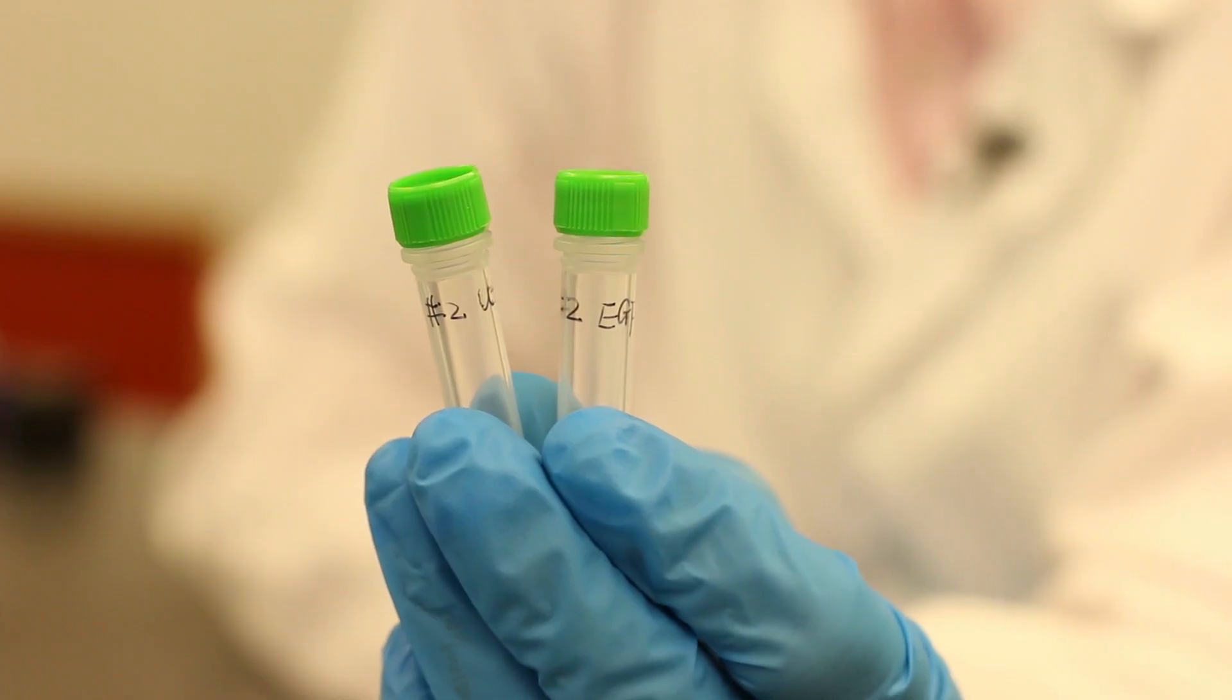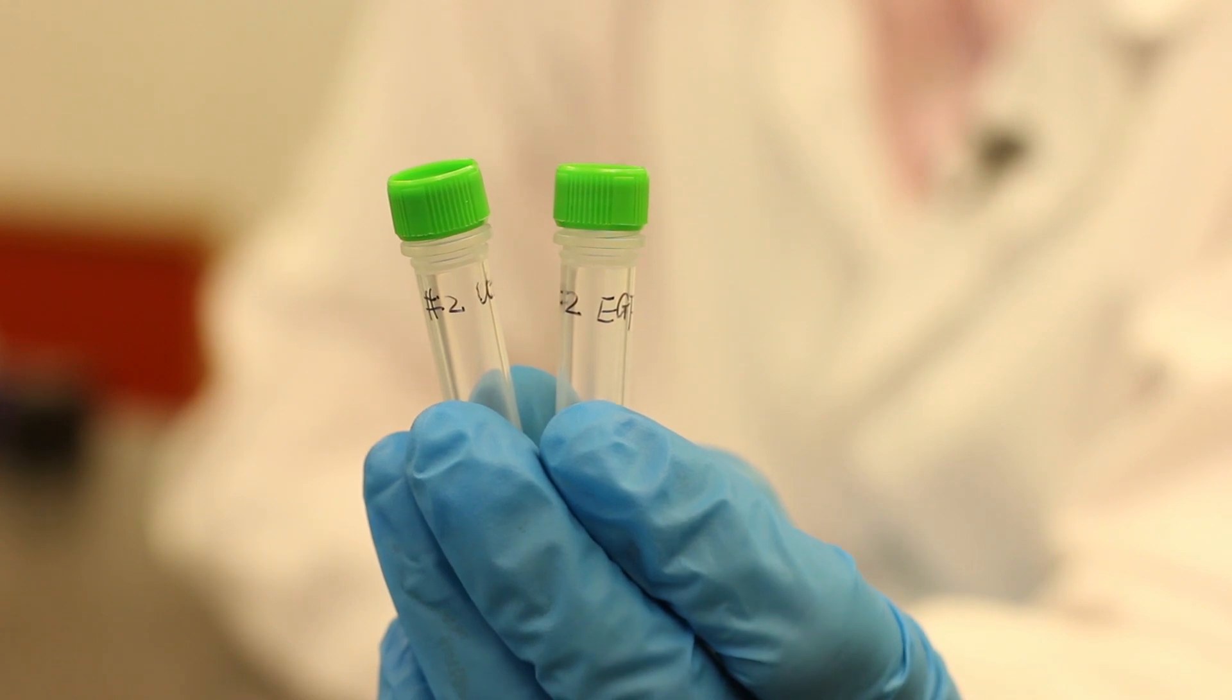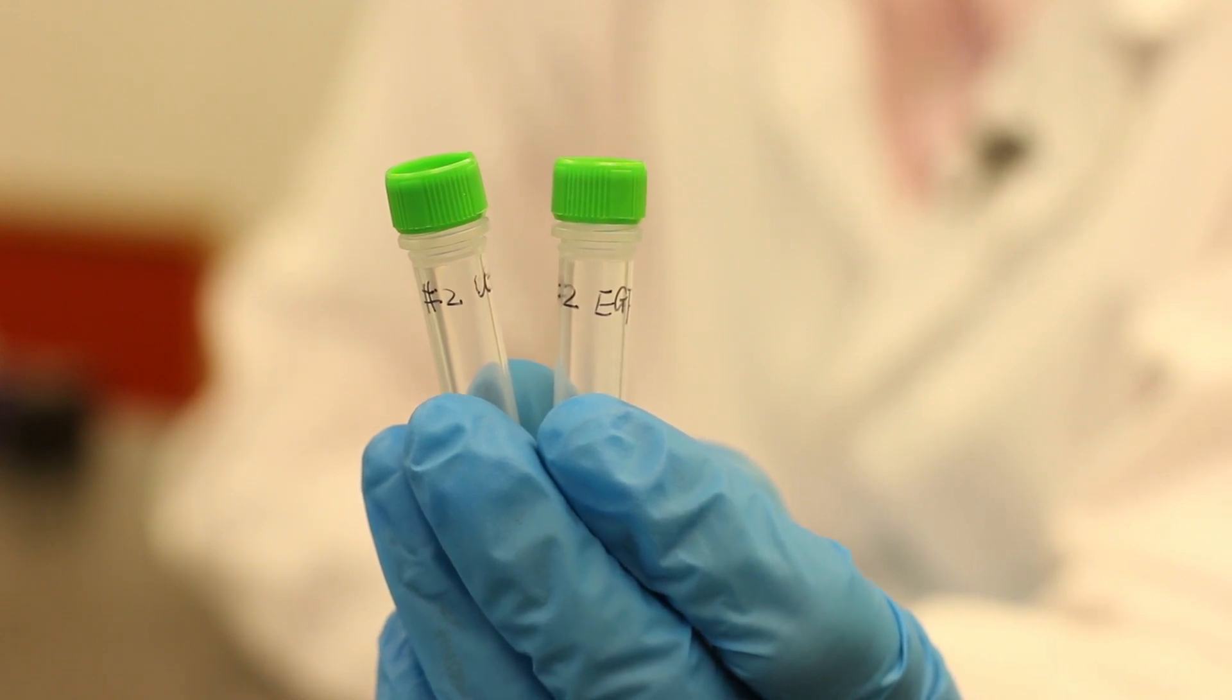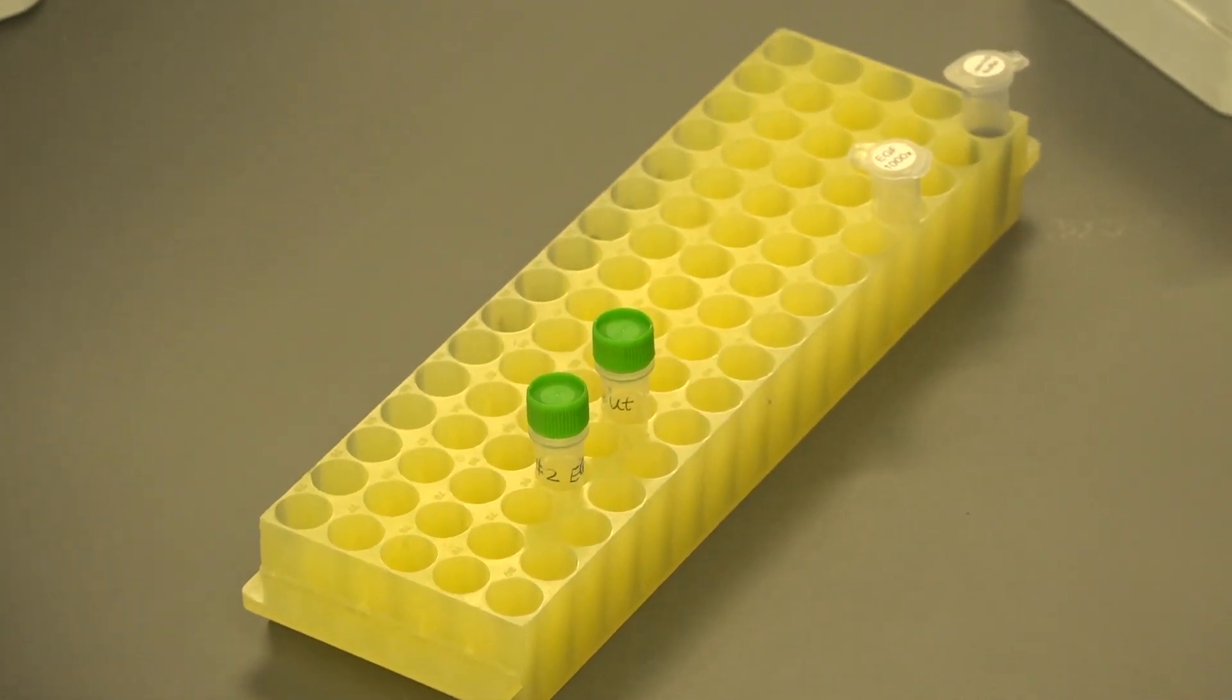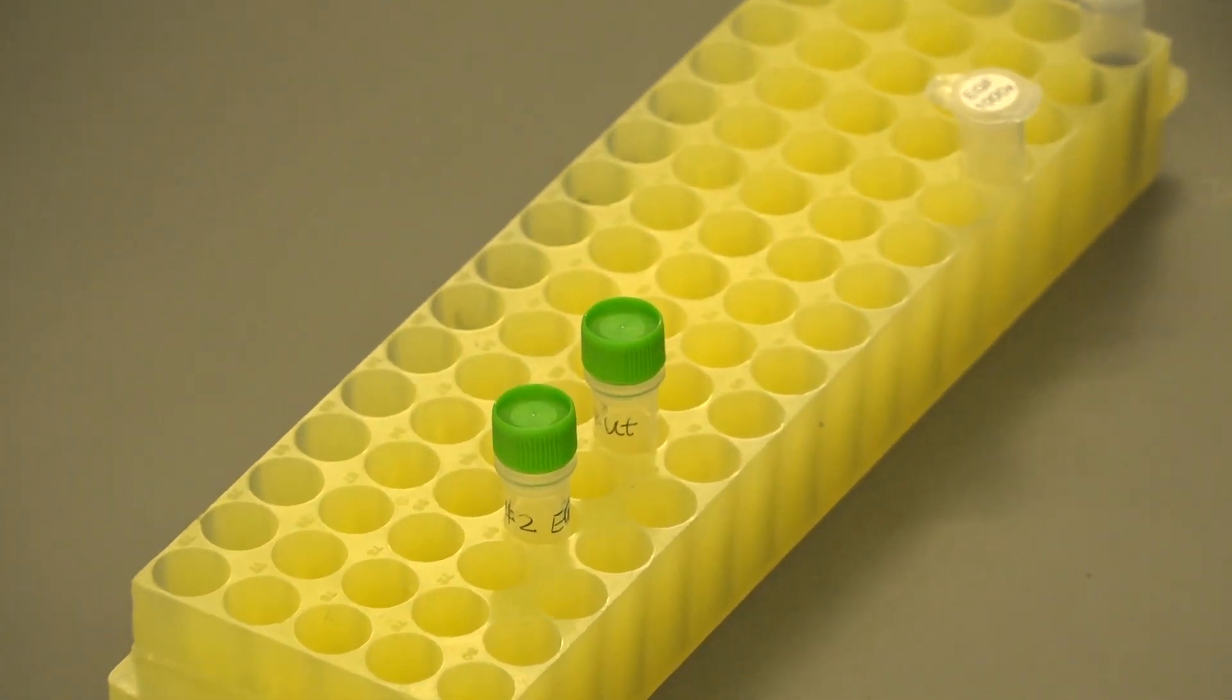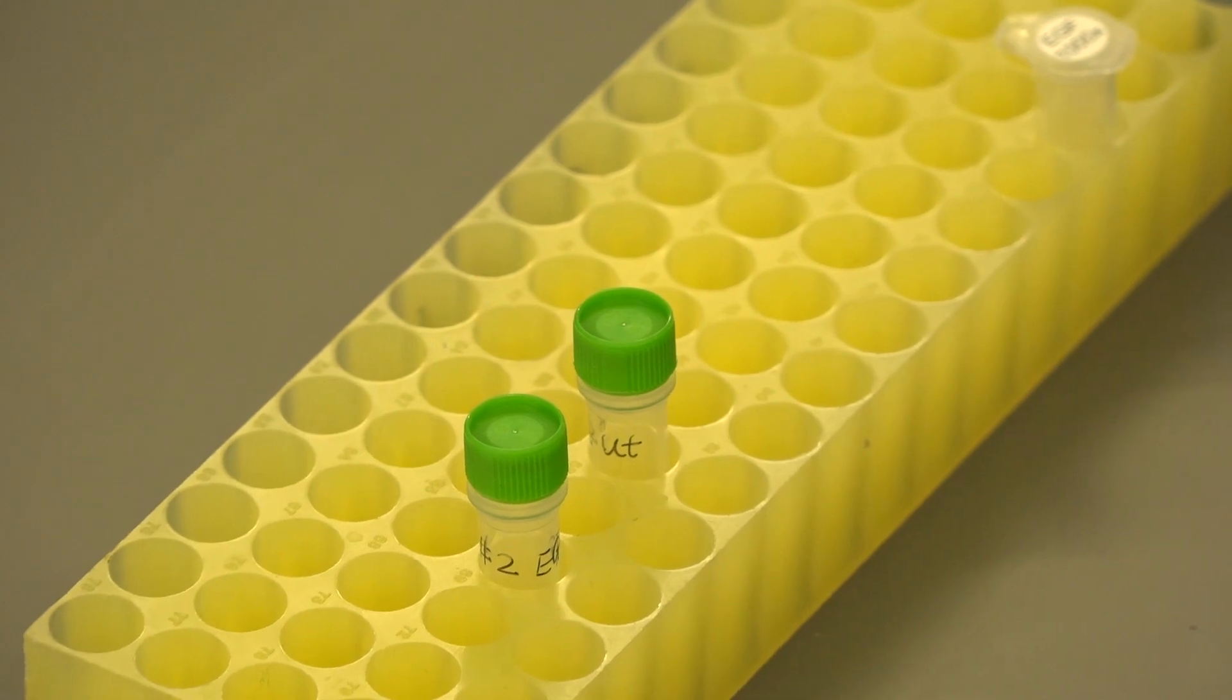While the cells are incubating, label two 2-milliliter screw top microfuge tubes the same way as you label the culture dishes. These tubes will be used to collect cell suspensions and lyse the cells later.